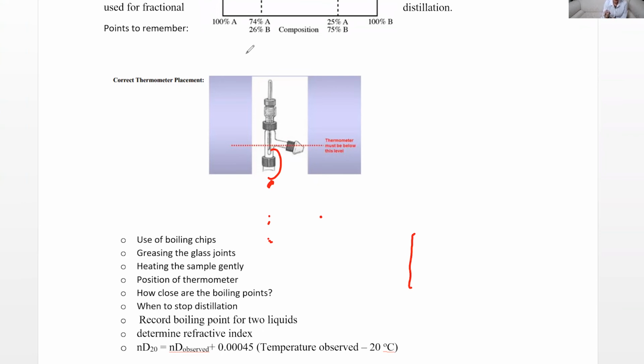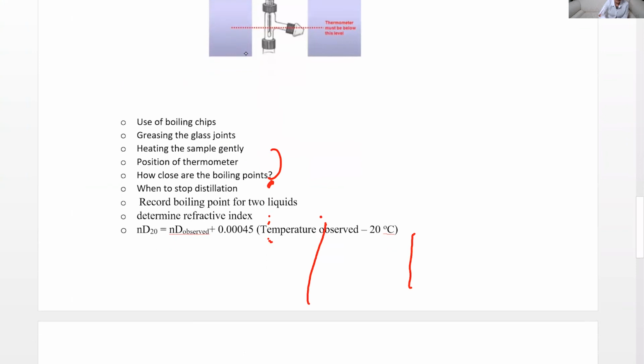Sometimes you see a fog or white cloud inside the boiling flask. At that point, you also have to stop the boiling. Gentle boiling is the key to avoid all consequences, okay? Which could be the bumping, and it could be the losing of the vapor.